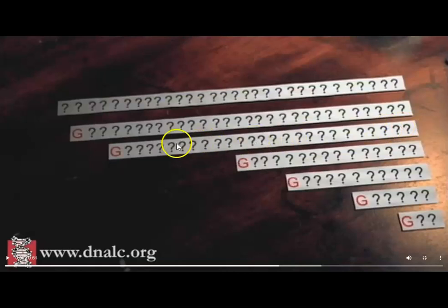And it doesn't matter how many G's are present in this case, but the replication stops any time that this G, which is a very specific G, is added to our machine. We are adding it to our tubes, sorry, so funny.